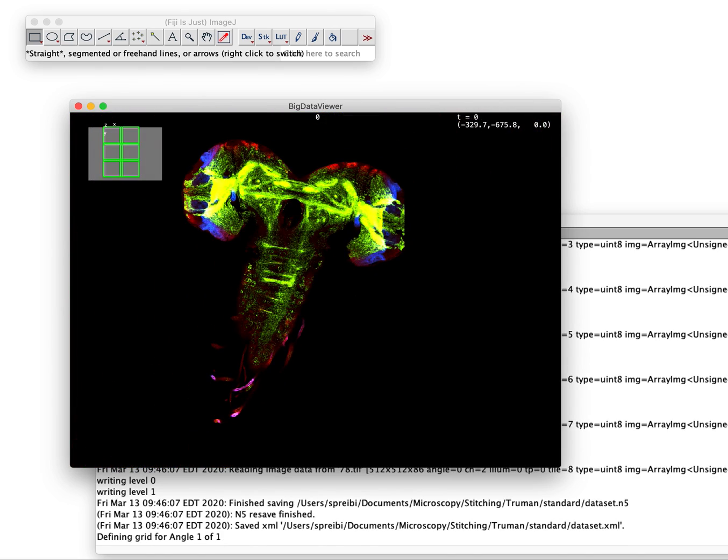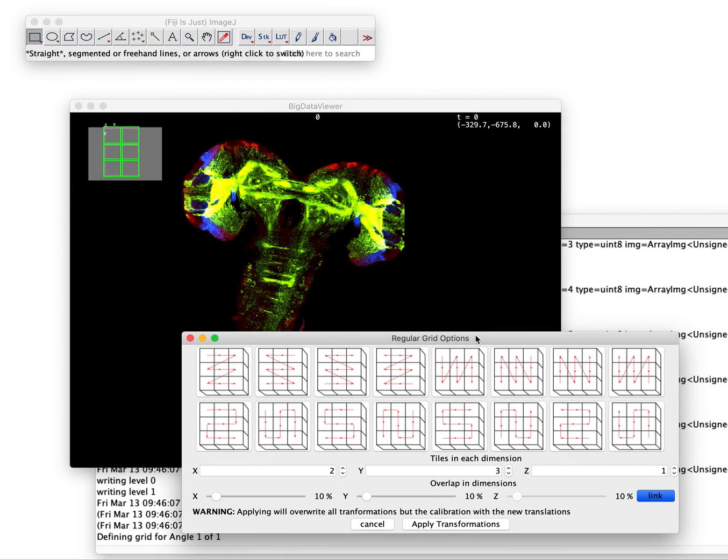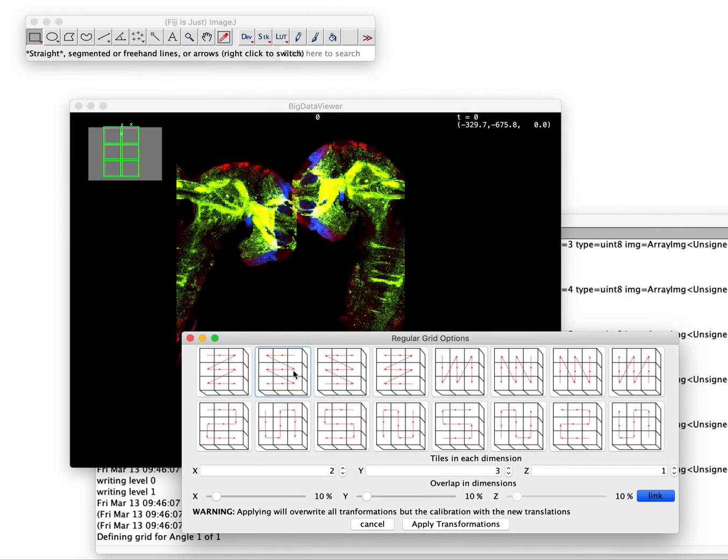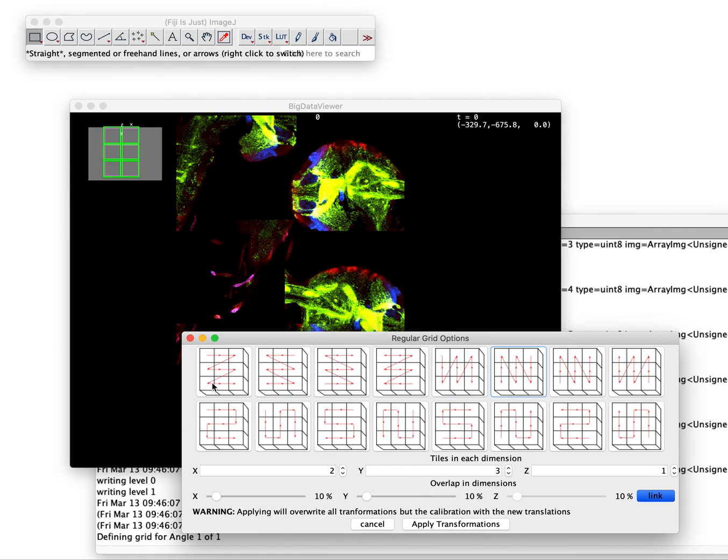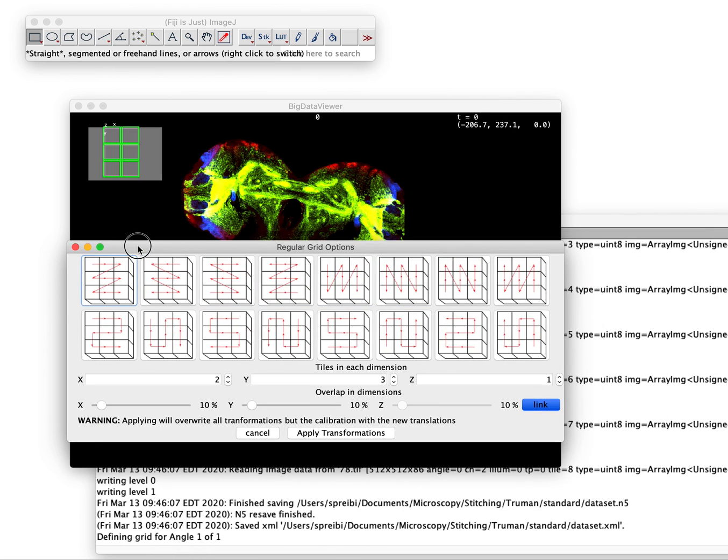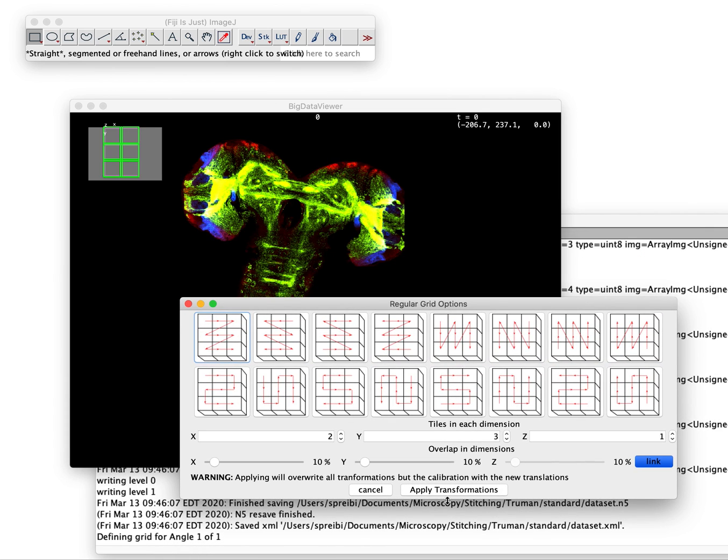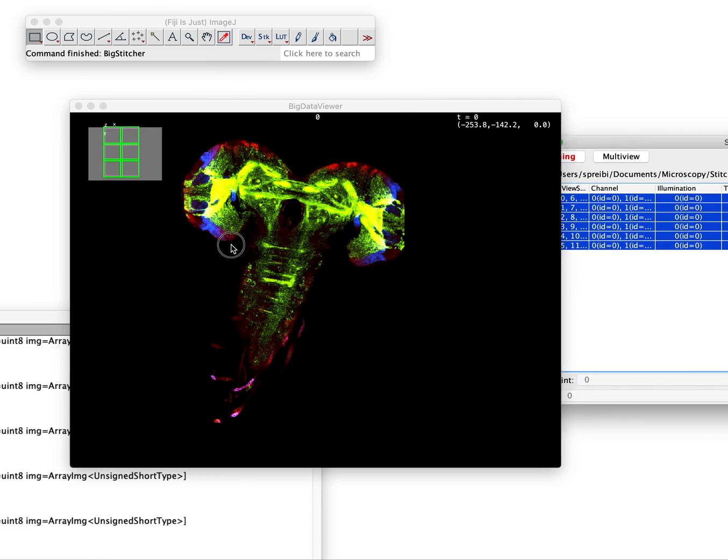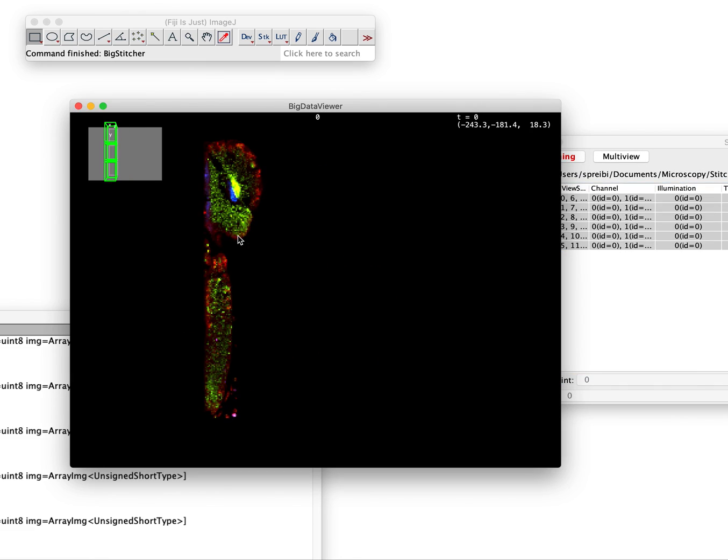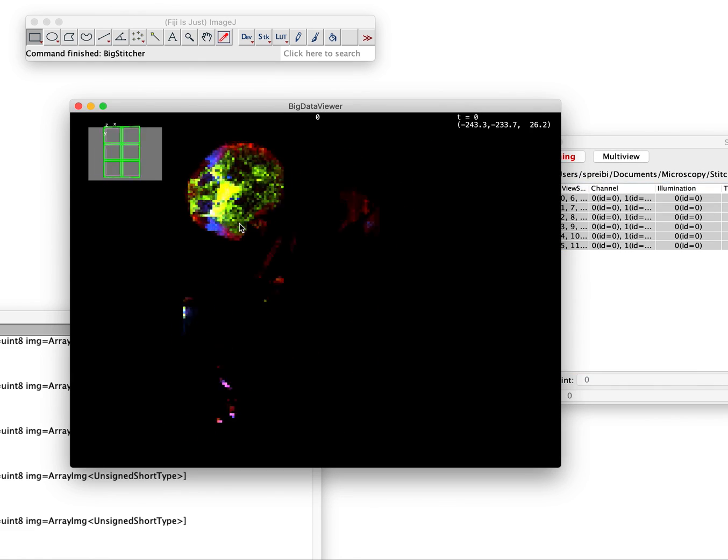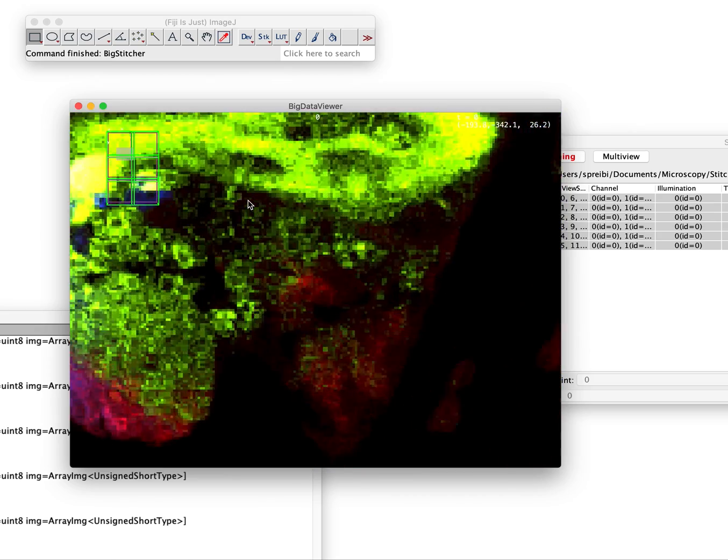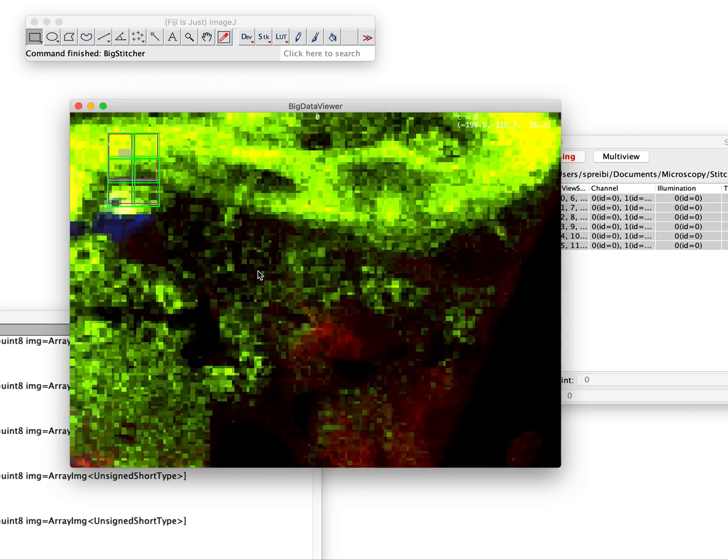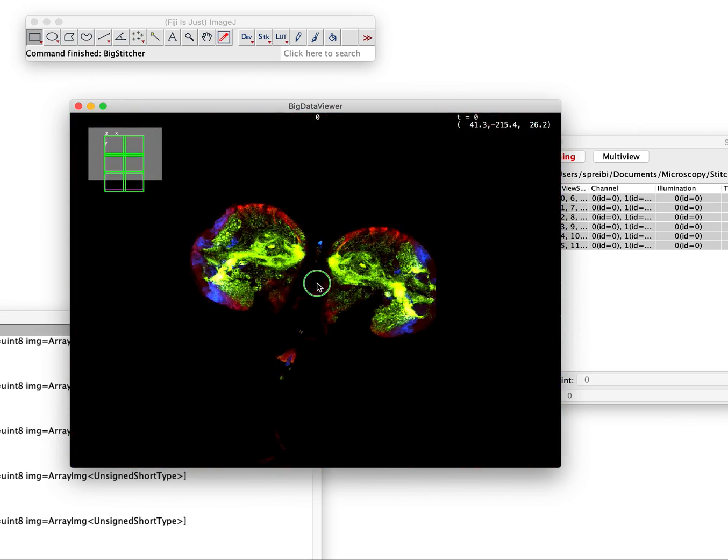Just since we're there now, we set to put it in a certain grid. In this case it's a simple 2x3 grid and then we're done and our dataset is available in beautiful N5 multi-resolution loading.